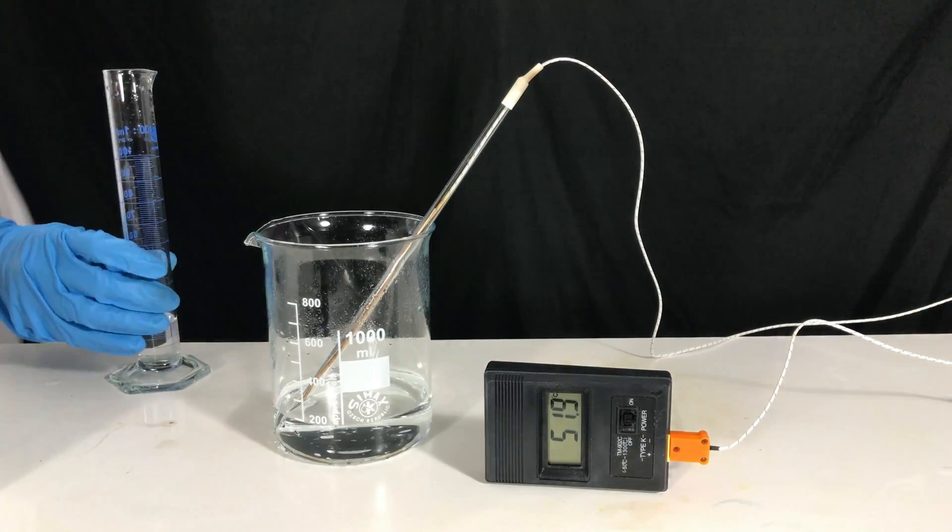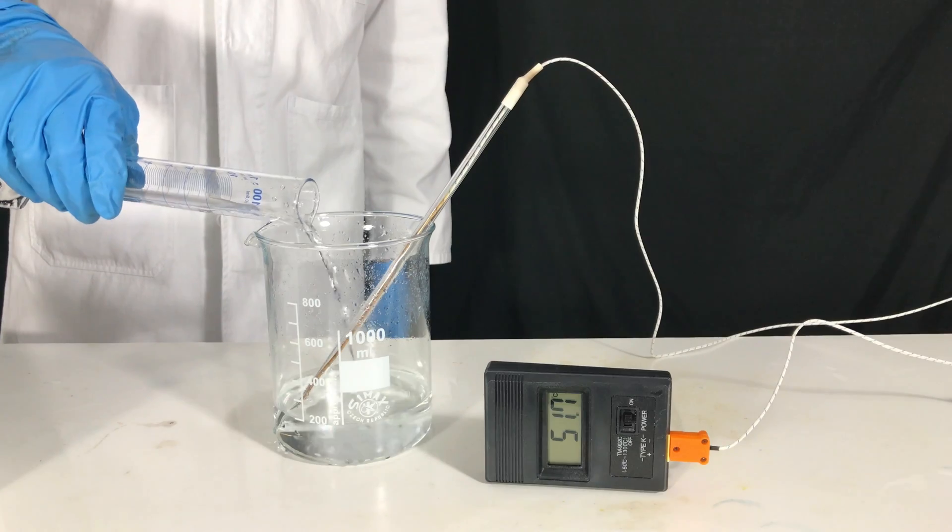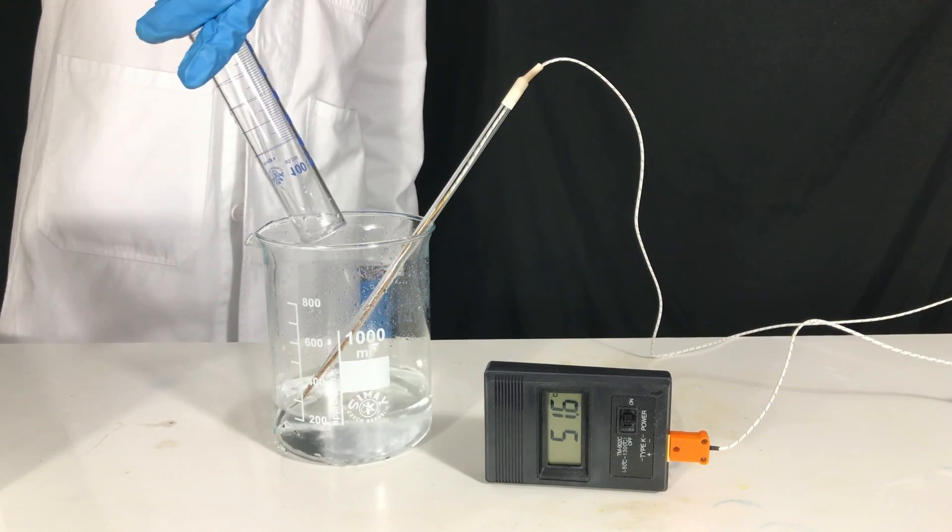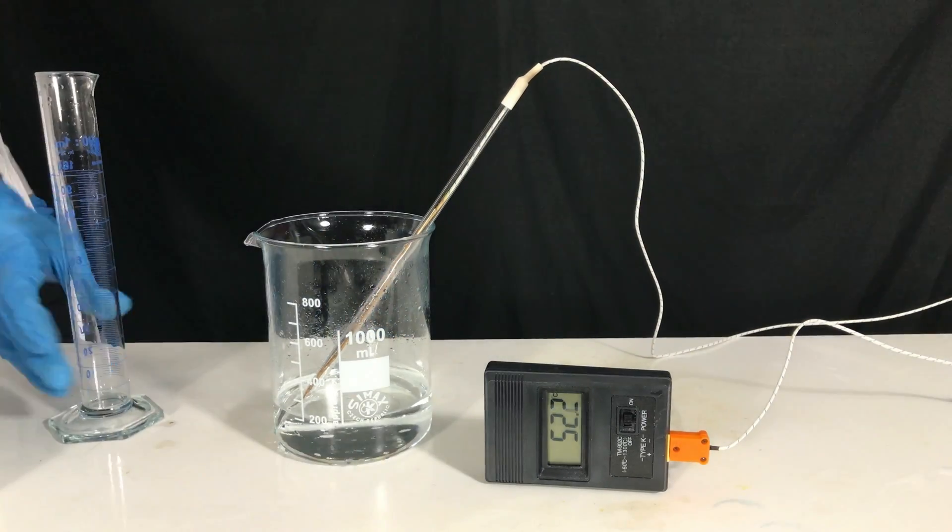The last 20 ml of now 40% formic acid were just straight away dumped in. At this point, not much heat will be generated anymore.